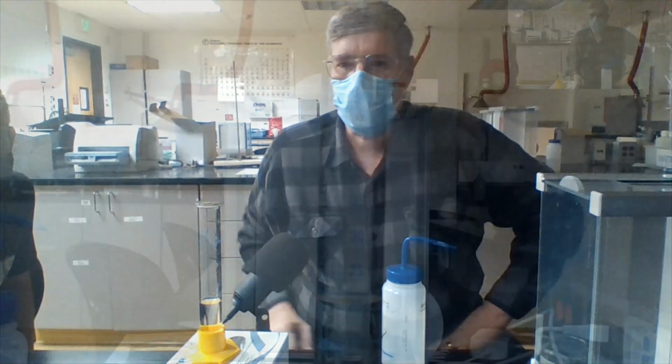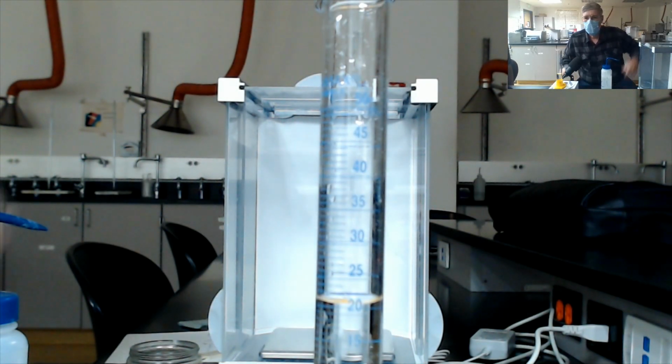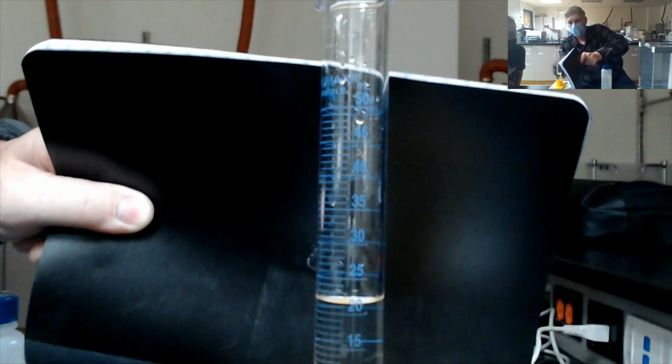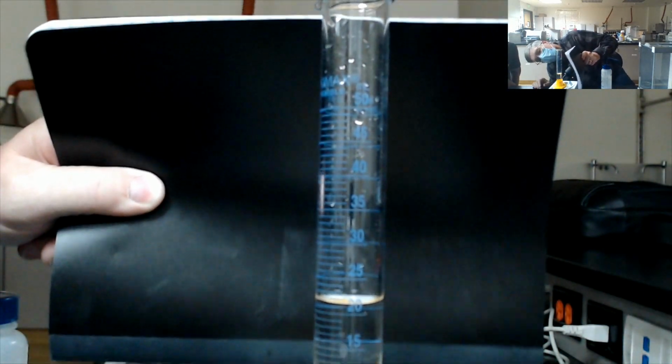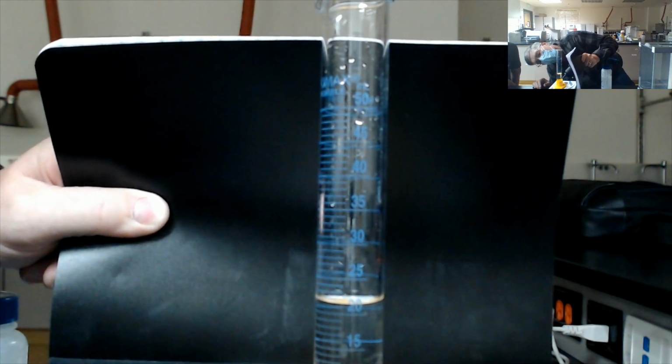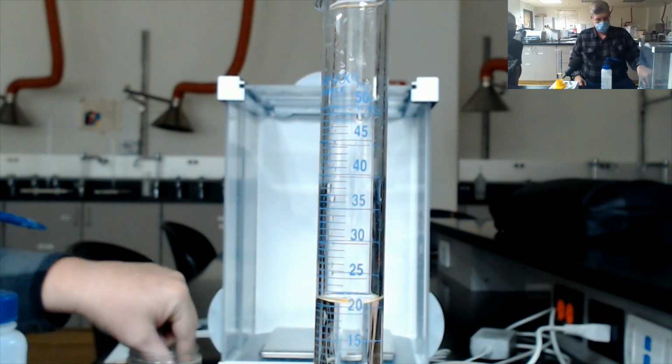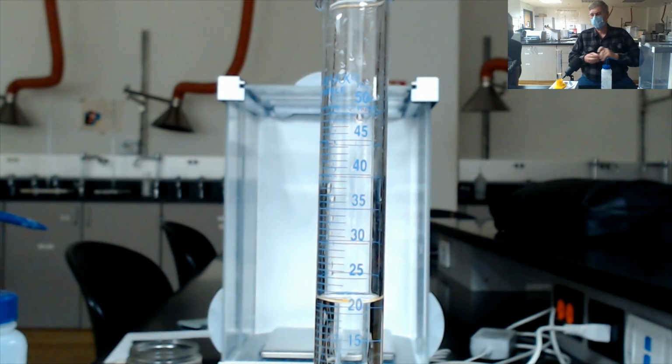Let's switch cameras. And we'll bring in this to make it a little darker. And it looks like the volume initially on this one is about 21.3 milliliters. I will help on the first one. So we write that down as our initial volume. Now switching cameras.